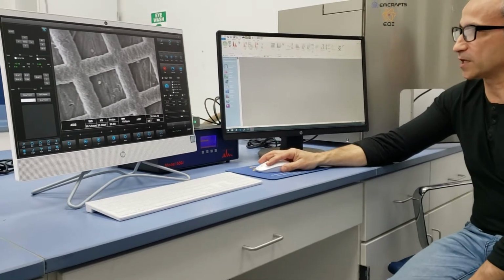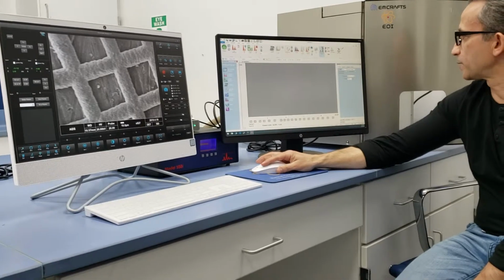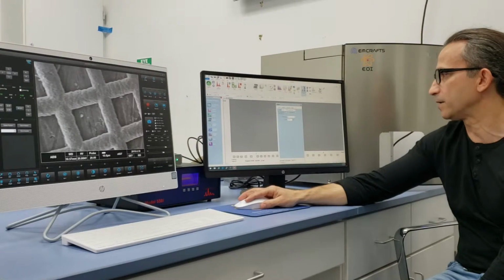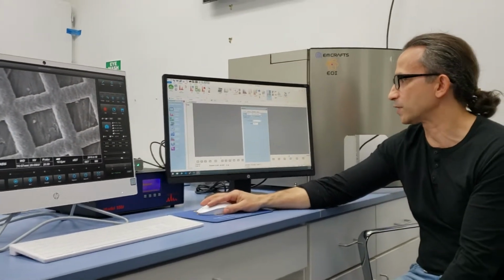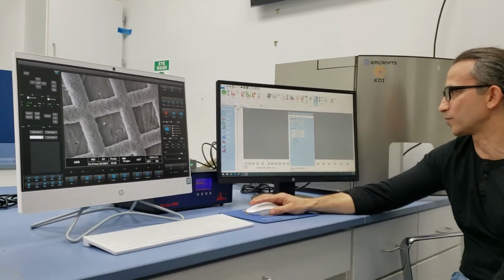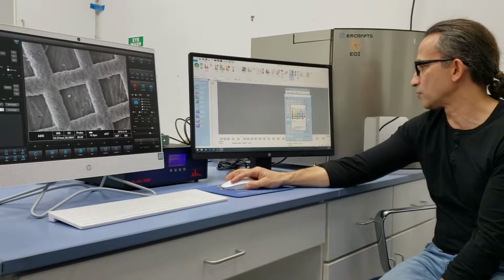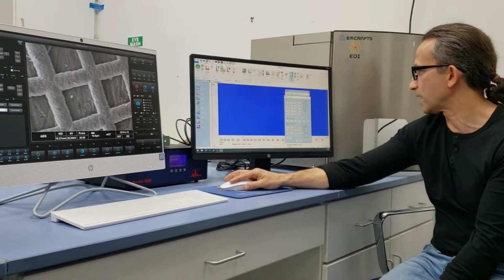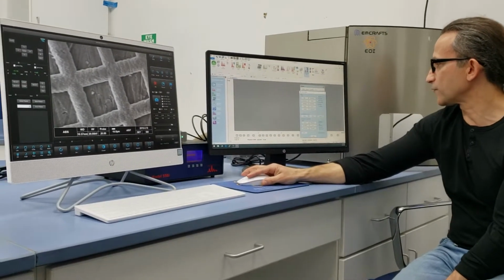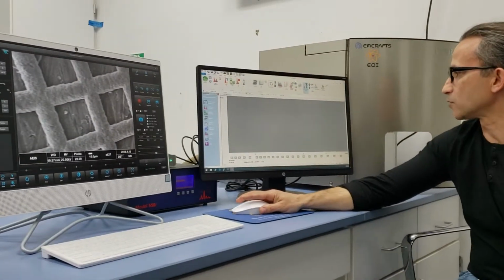Alright, so the first thing it says, review the Spectra properties. So let's take a look at the Spectra properties. It opened up a base Spectra window because the properties window opened up as well. And this is just a basic properties window saying that, hey, you're doing a 20-second acquisition. That's what we had in there as the default. And there's just some element ID stuff in there, some quantitation, some display stuff like, for instance, display and print settings. If you don't like the background being gray, you can make it like blue or something like that. Or the background could be gray again. You know, whatever. There's a lot of stuff in here, but for now, I'm just leaving everything as a default setting. And don't worry about the property.